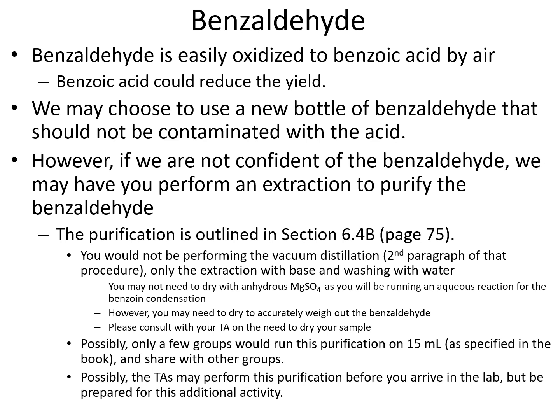And then purification of benzaldehyde. I think this is something related to the second experiment during this course. If you remember, the first one was safety, second one was purification of benzaldehyde. If you're interested, you can go back and visit that experiment.